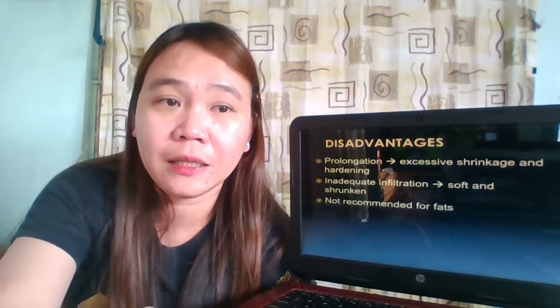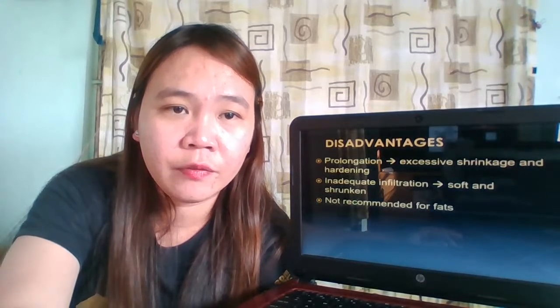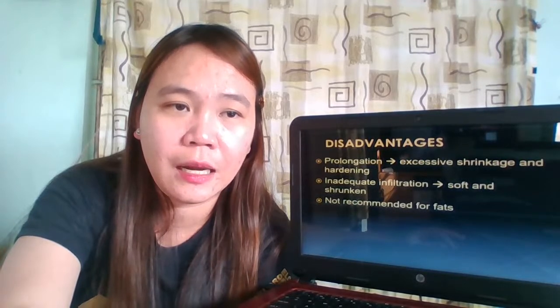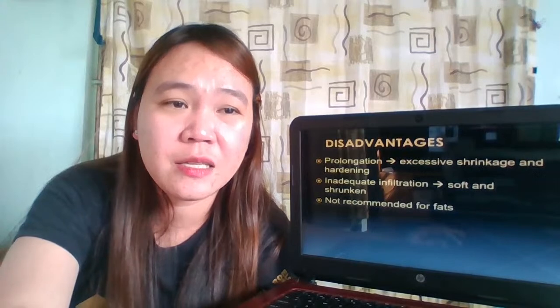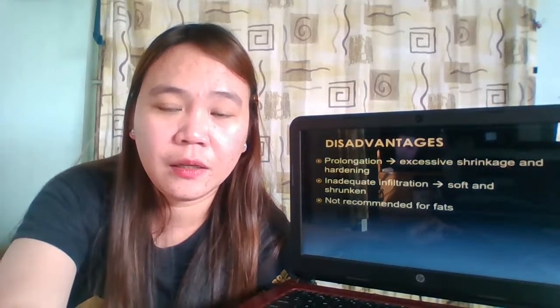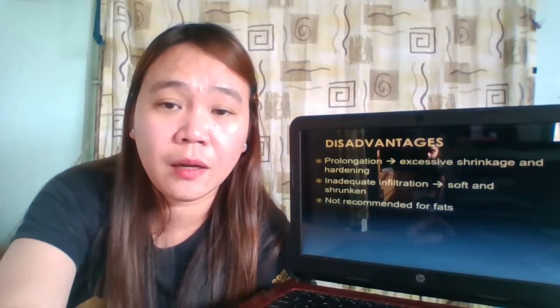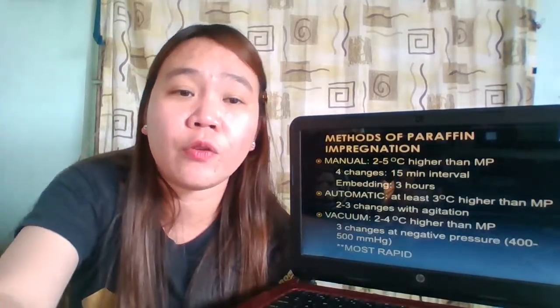I would have to cut it after paraffin embedding, and then let's take a break and I'll stream again later. After paraffin embedding, we will start with paraffin substitutes.